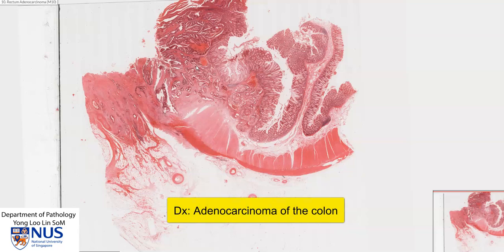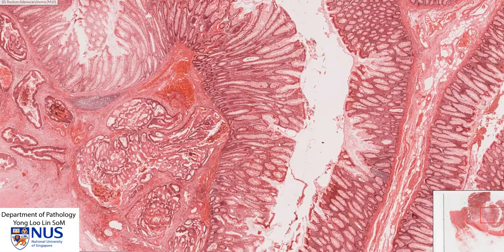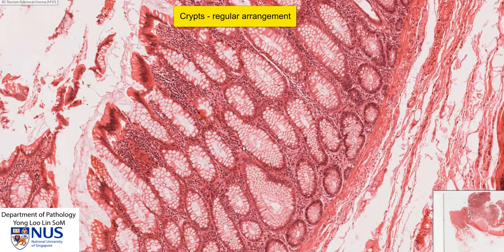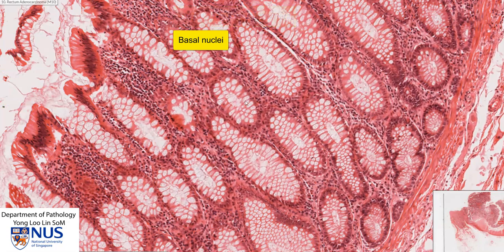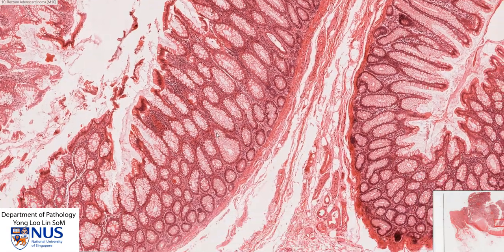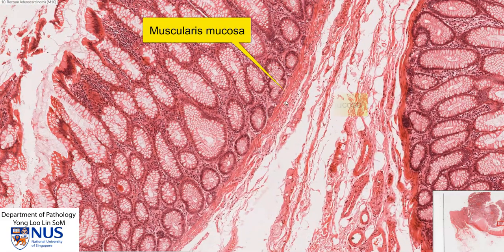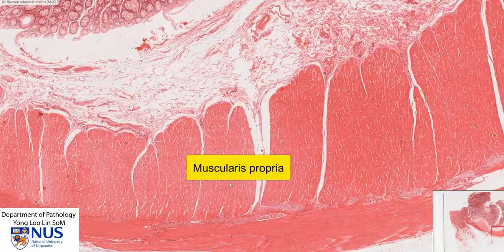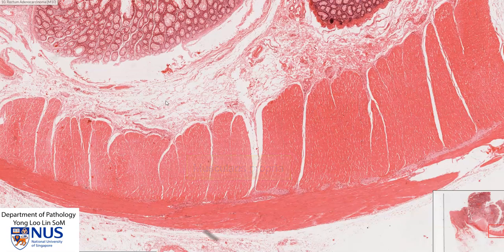The diagnosis here is adenocarcinoma of the colon. Let's first have a look at the normal colonic mucosa. We can see that there are very regularly arranged crypts, lined by cells with very basally located nuclei, and they have extremely prominent and abundant goblet cells. These goblet cells contain mucin. We can also see the muscularis mucosa with the submucosa and below this, the muscularis propria. Everything is very orderly here.